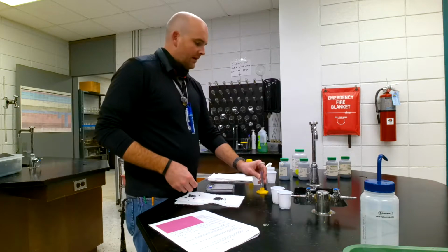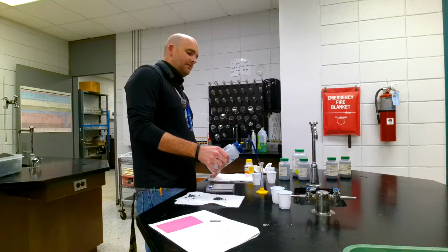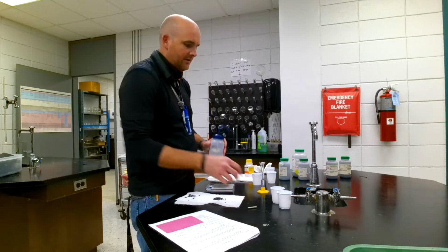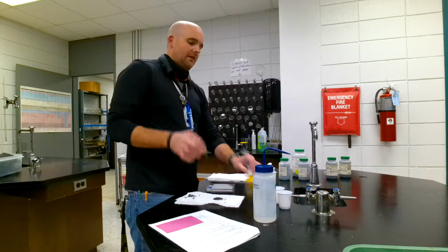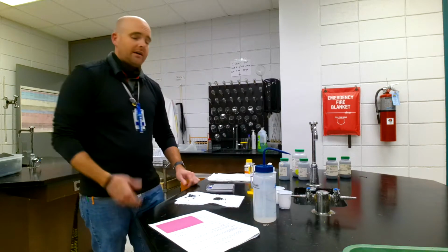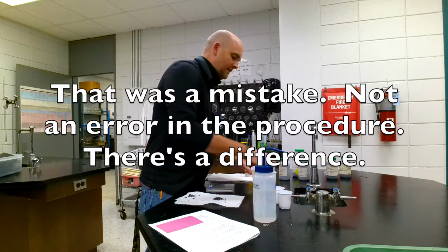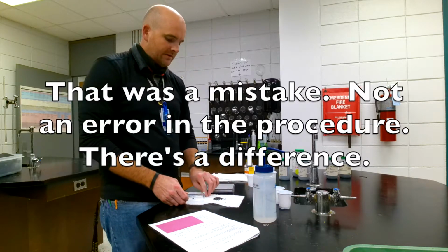And then what you would do is you would take a graduated cylinder and you would fill up a little bit of water. Make sure that you have more water than the actual length of the metal. Drop it in, you slide it in so that you don't break it. And I missed a step. Classic Mr. Russell. Okay, so what I should have done was, let me dry this off here.